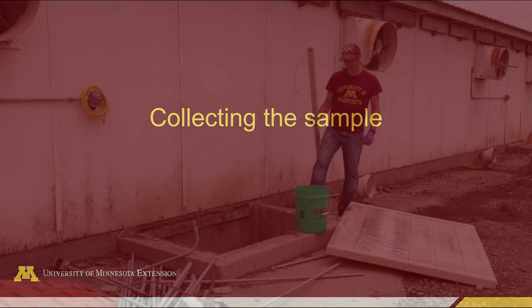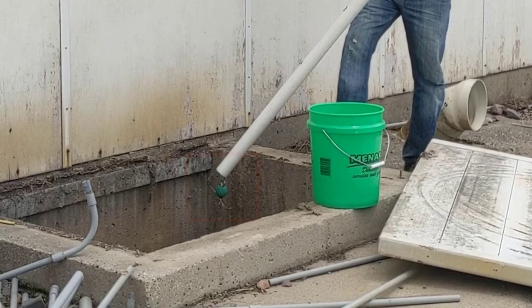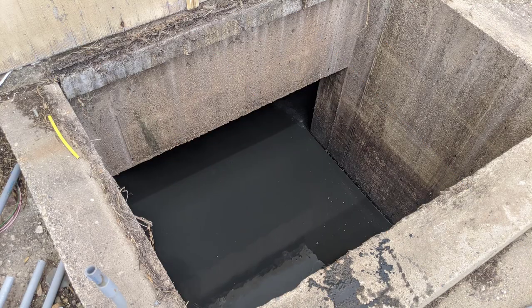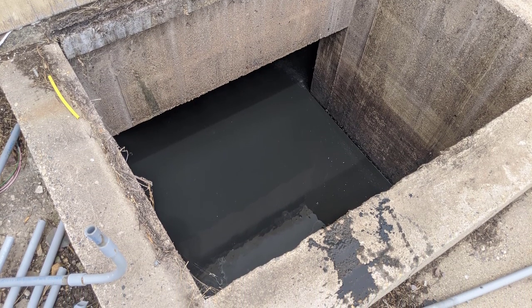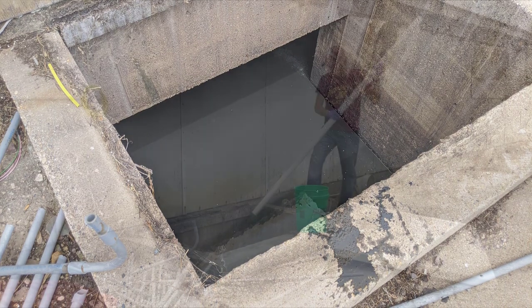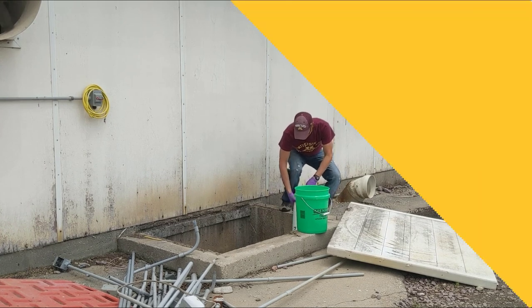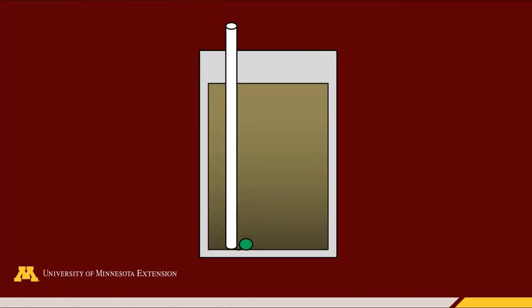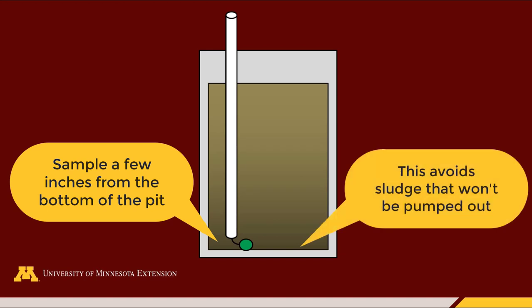Collecting the sample. Before starting, make sure the wire is pulled the whole way through the PVC pipe but that the ball is loose so that the PVC pipe is open at the bottom. Make sure to avoid areas in the pit with a sump, as these areas tend to collect a lot of sludge that won't necessarily be pumped out and land applied. Once you're ready, lower the PVC pipe into the pit until you reach the bottom, then pick up the PVC pipe by a few inches. This will allow you to maneuver the ball into the pipe as you're trying to close it, but also avoid sampling some of the sludge that might accumulate and can't be pumped out every year.